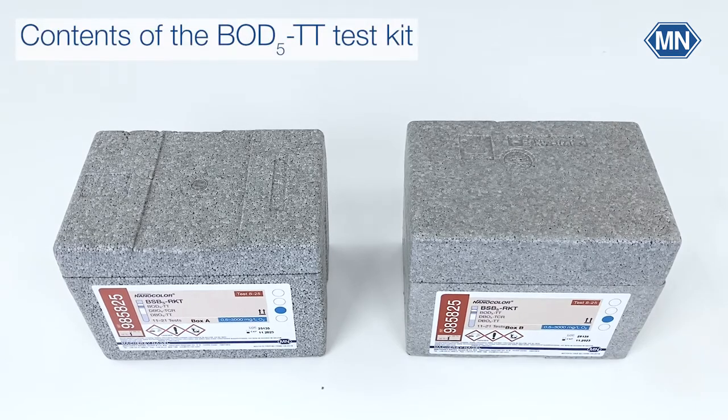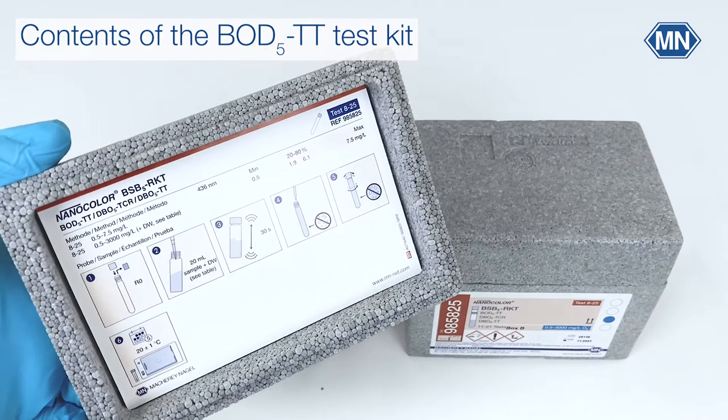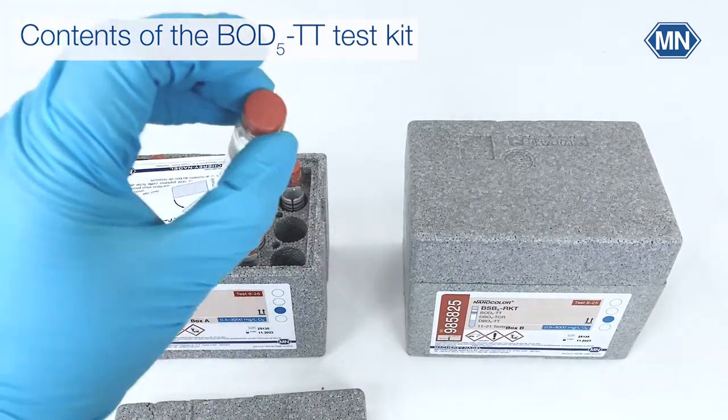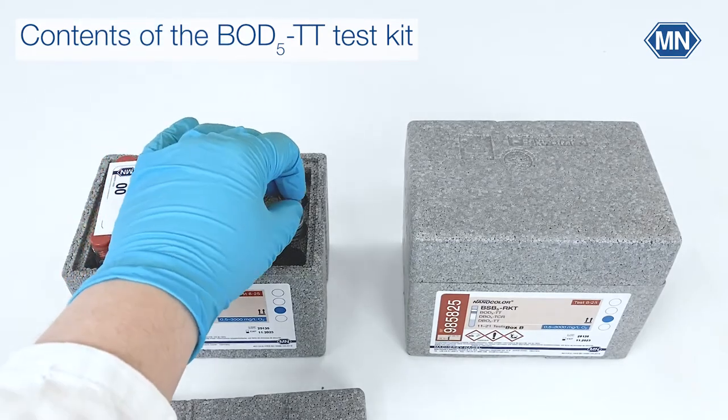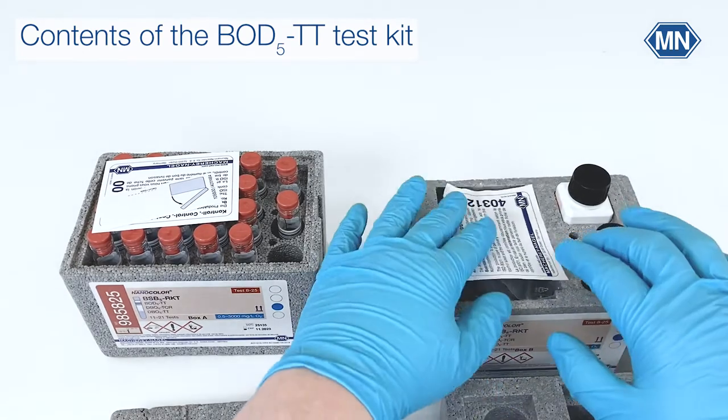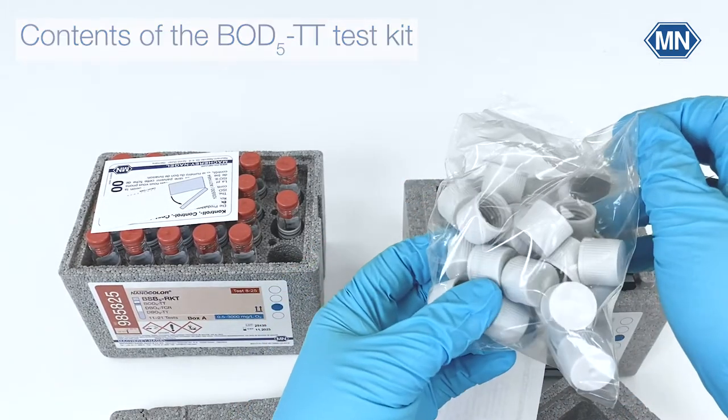Each test kit comes with two boxes. In box A you will find the pictogram instructions in the lid. You will also find 22 test tubes with rubber stoppers. In box B you will find additional reagents and also 22 screw caps for closing the test tubes again.